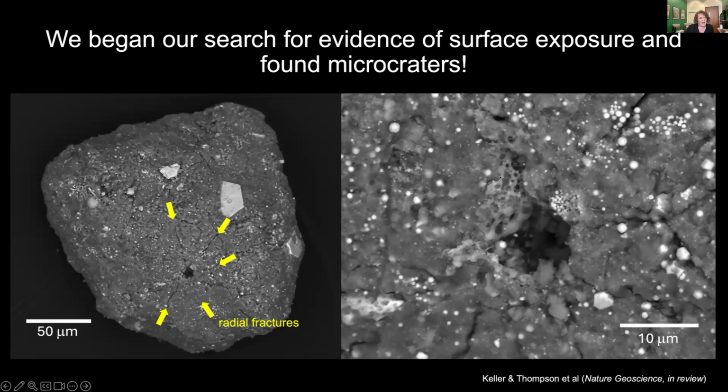And then if you look at higher magnification, there's this really vesiculated, frothy deposit that's lining the inside of this crater. That is the melt deposit that formed as a result of that high velocity impact, melting material on the surface of Bennu.